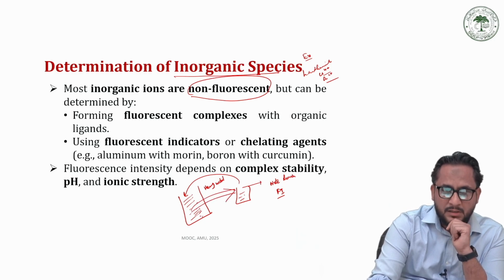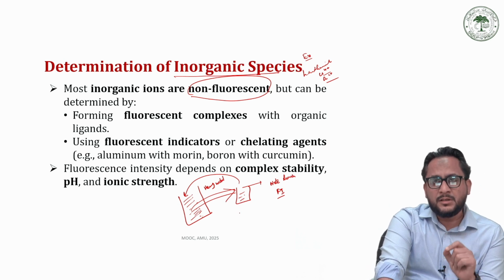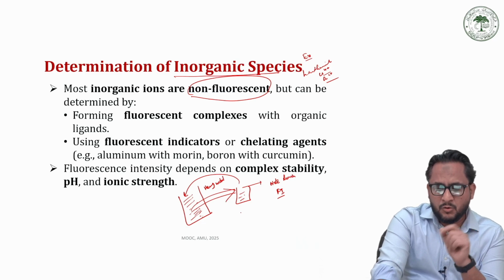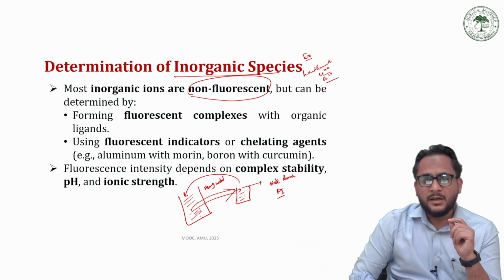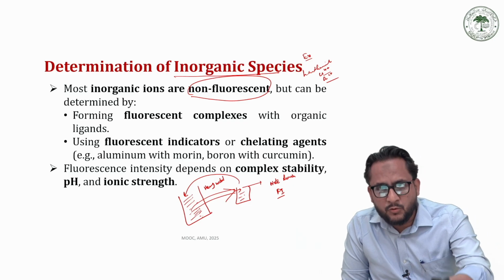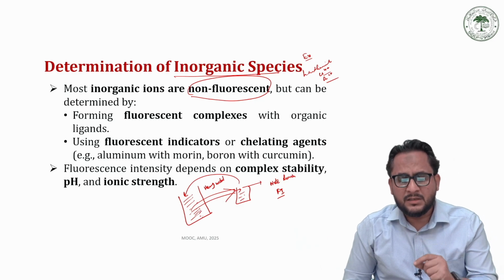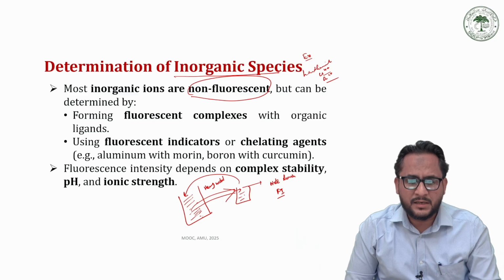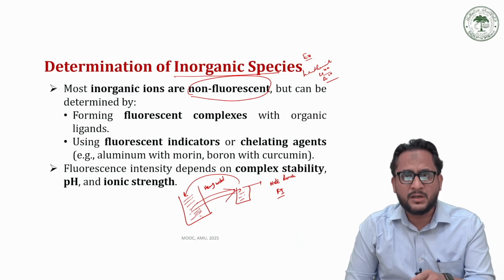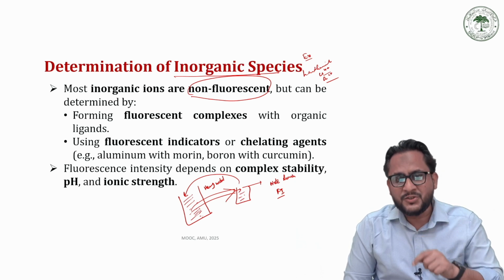And then we add the sample water into this solution of the fluorescent molecule, which is already showing fluorescence. The moment we add this sample, if it contains some heavy metals, those heavy metals immediately go and bind to these fluorescent molecules. The moment it happens, there will be a marked shift or significant decrease in the fluorescence intensity, and at that point we can say that yes, of course, some heavy metals are present, and then based on the reduction in the intensity of fluorescence radiation, we can even identify the concentration of those heavy metals.